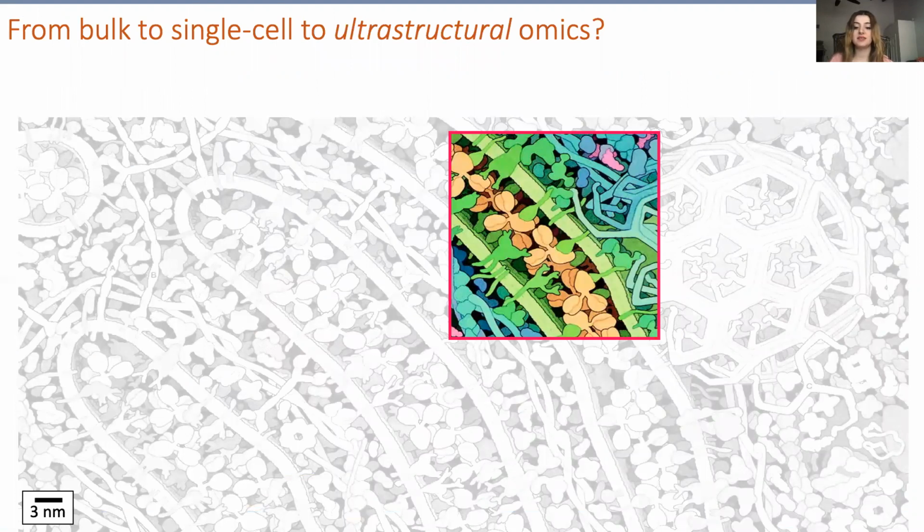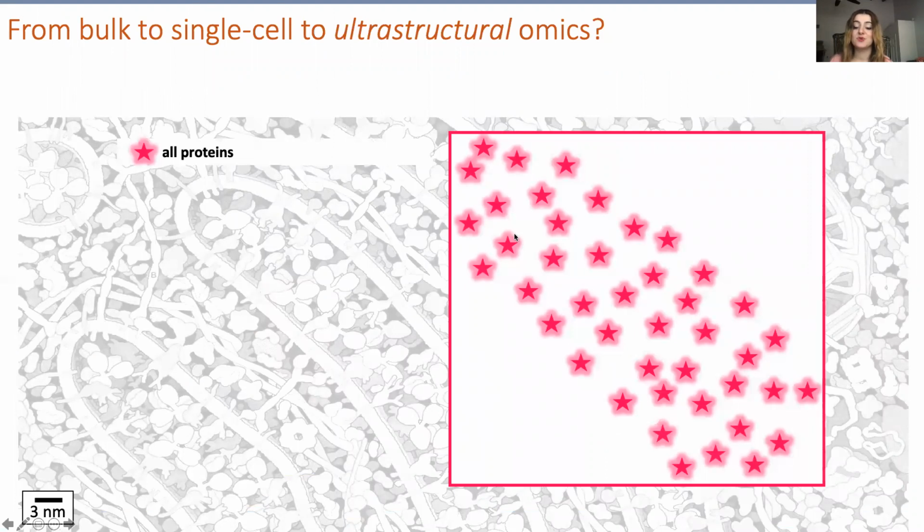If we take this area of the Golgi apparatus here and we expand it with Pan-ExM, with STED microscopy or perhaps higher expansion factors, we should be able to see individual proteins, as the spatial resolution should approach 2 nanometers. And I've shown this, and I've explained this earlier with my Golgi images. So what if we now did the opposite of what we conventionally do with fluorescence microscopy?